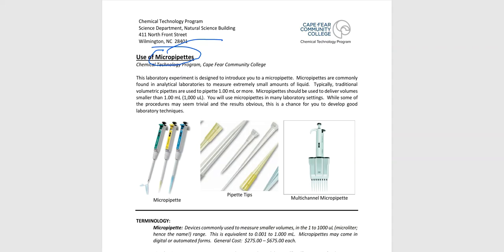Well, guess what? Micropipettes are little bitty tiny. No, they're not little bitty tiny pipettes. That's not how this works. Micropipettes are going to be delivering little teeny tiny volumes in a laboratory setting.